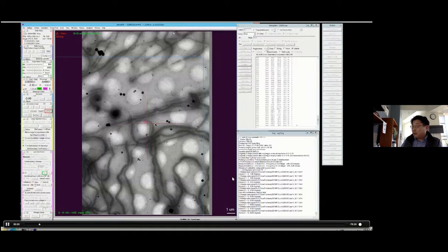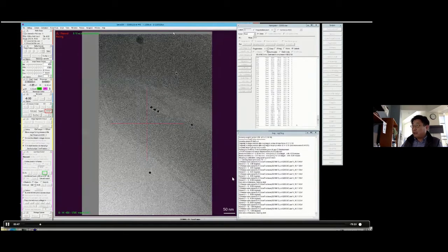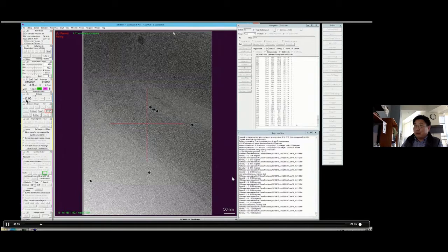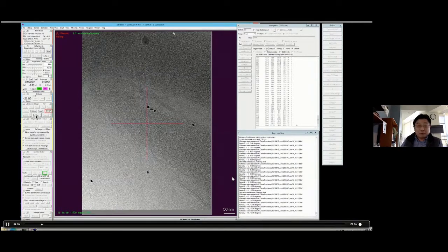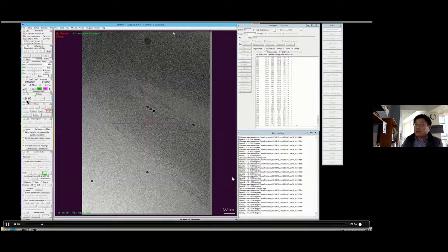So we worked with Chen Xu to develop the software to make this tiny change, to make sure that at -3 degree you can see the area being tracked is still in the middle, and again the gold remains in the center. So this goes to -12, and every 3 degrees you very quickly collect data. The whole idea of fast tomo is that you can control it based on your own needs, and also collect data as quickly as possible, skipping a lot of steps that are typically required, like focusing and tracking. Now this will go to -24 degrees.